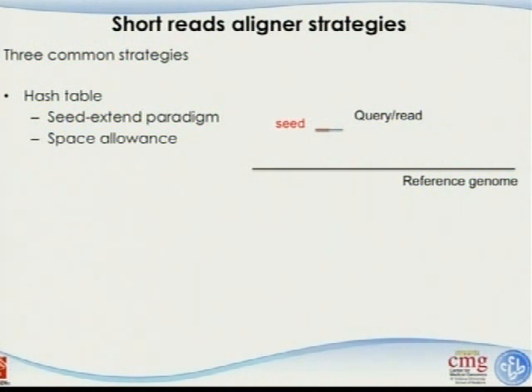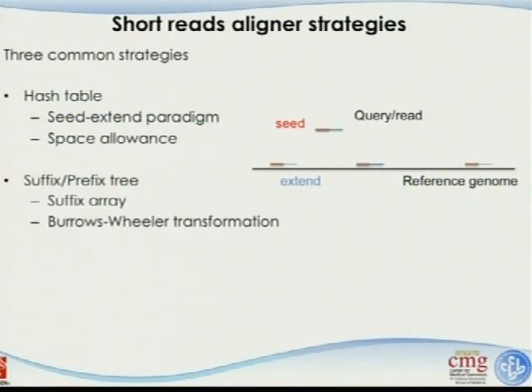So what you do is you first index the seed, and then you align the seed back to the reference genome, and then you further start from there, because now you don't deal with the whole entire human genome, but rather very small parts, just very close to the seed part. And then you further do the extension to calculate how well these two sequences match. So you can see that I make it a little faint, saying these two don't really align well, and this one really aligns strongly, and that will help you to speed up the alignment process. Okay, very straightforward way of thinking.